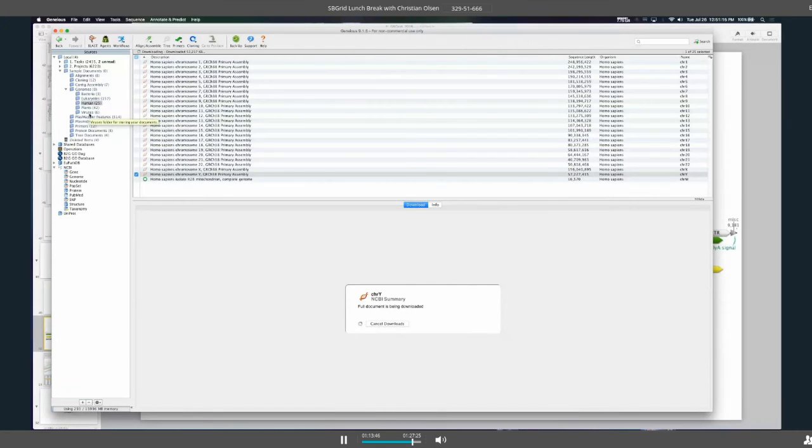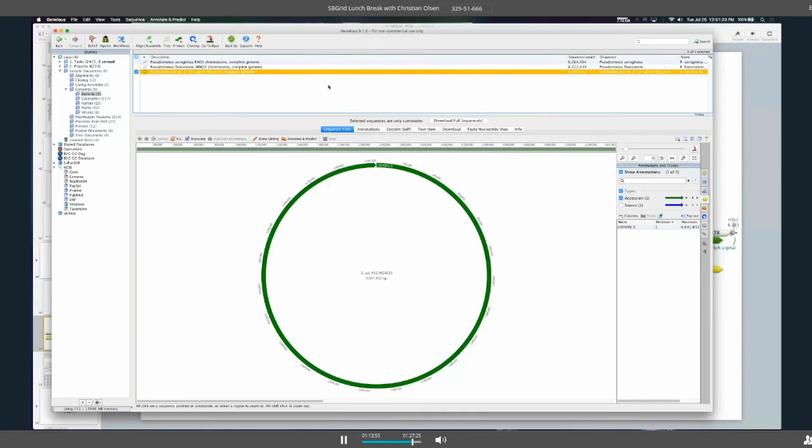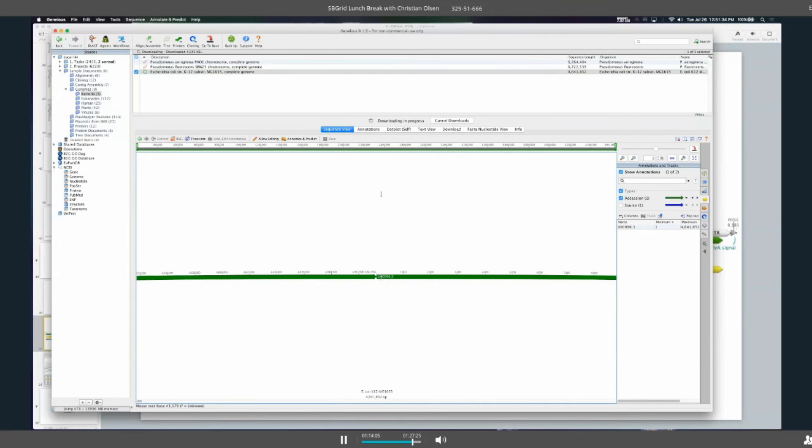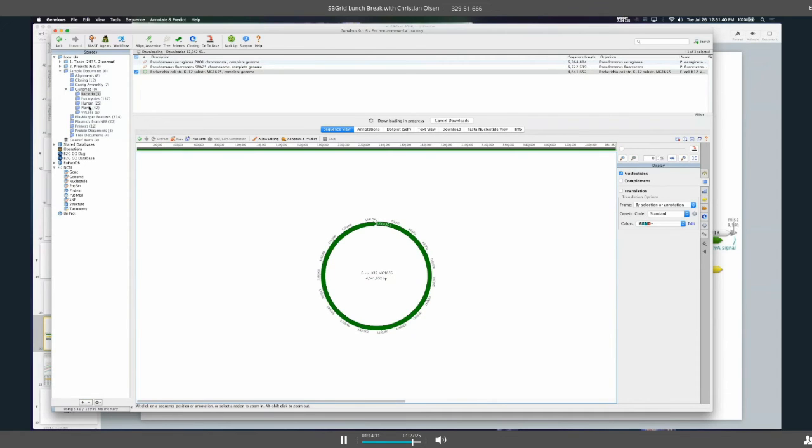We have the same for bacteria, eukaryotes, plants, and viruses. Actually, this may take a little long. So let's just try E. coli. This will show you the power of using annotations that have been affixed to the sequence to leverage.